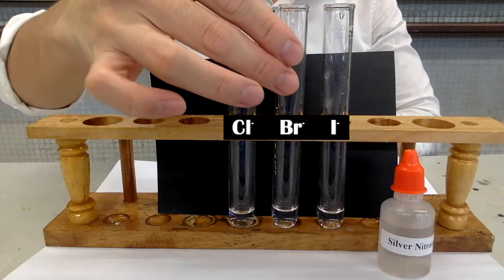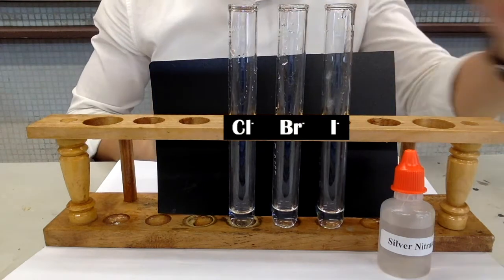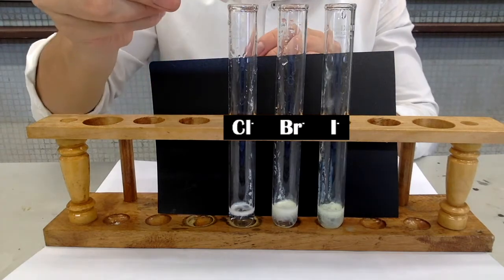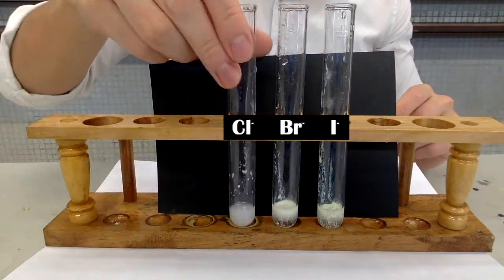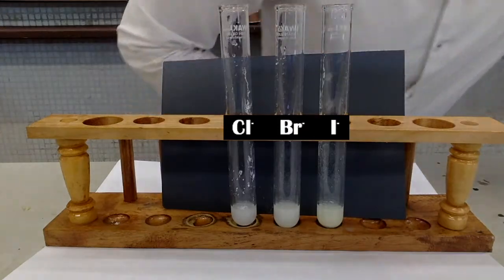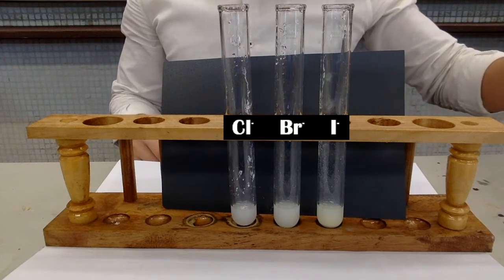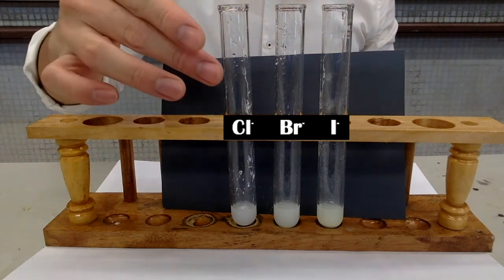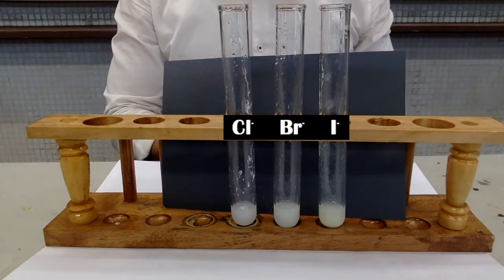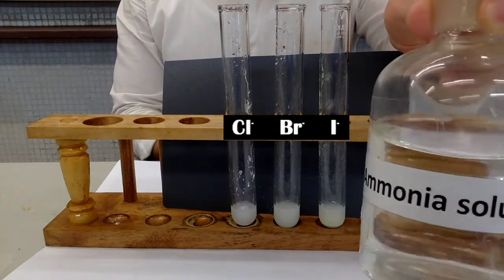Aqueous solutions containing chloride, bromide, and iodide are prepared. A few drops of silver nitrate solution were added into the samples. The solution containing chloride gives a white precipitate. The solution containing bromide gives a creamy precipitate, while the solution with iodide gives a pale yellow precipitate. It is quite difficult to distinguish between the colors of the three precipitates.